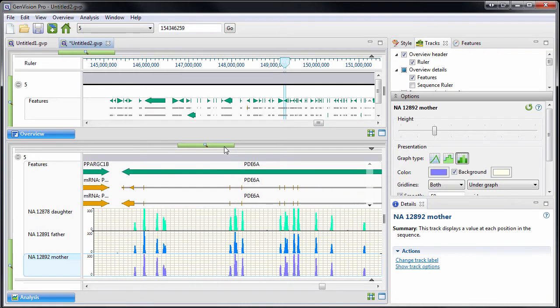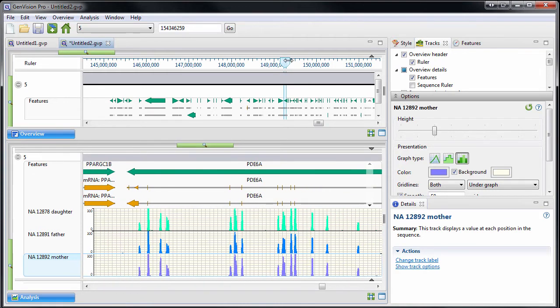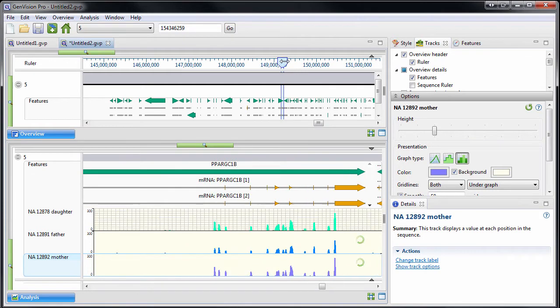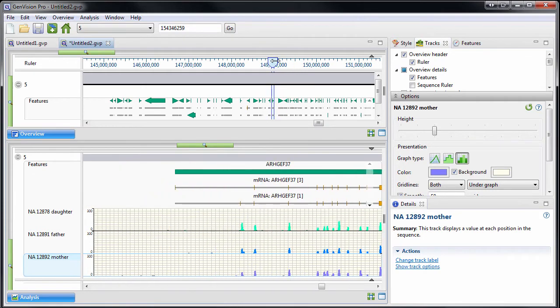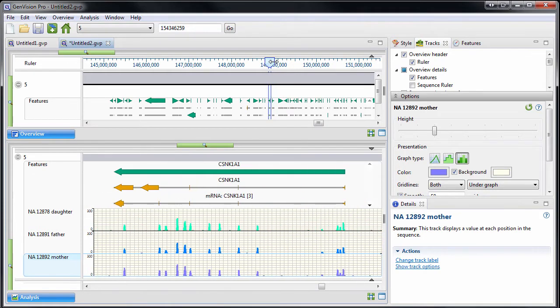You can also use GenVision Pro to analyze multiple project types together, for example, a combination of RNA-seq and ChIP-seq peaks.